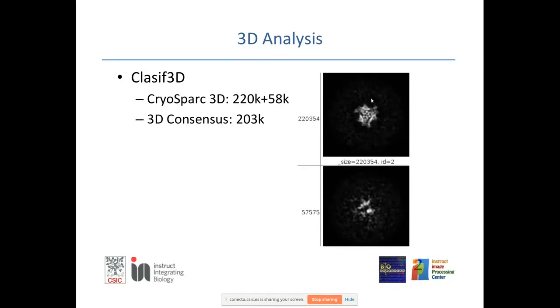The only way to know, and there is no guarantee, is if you repeat the process and all particles get the same label. You don't know if that is the true label, but with the tools you have, with that classifier, you cannot say that they have a different label. And actually, if you repeat the same process twice, you get the same amount.